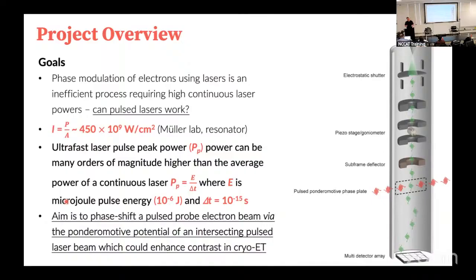It's very hard to deflect that. So you're having to try to deflect a very powerful beam after it has passed through the sample, so in a post-specimen way, and you're asking it to do that with effectively something like this.